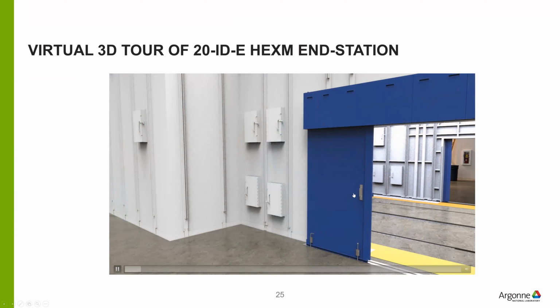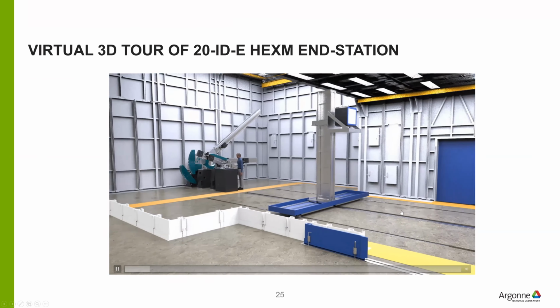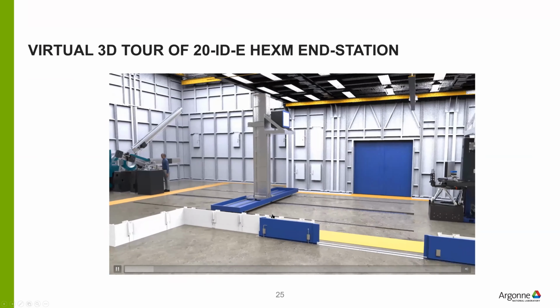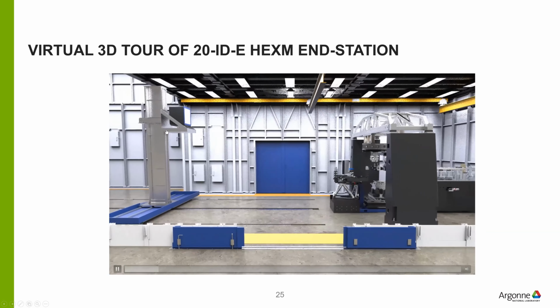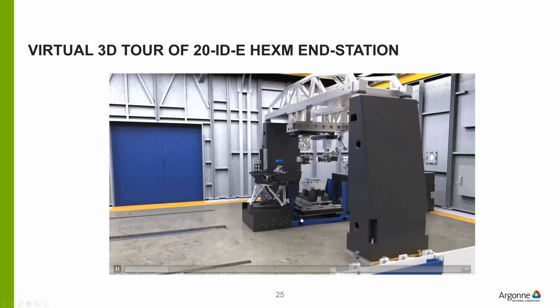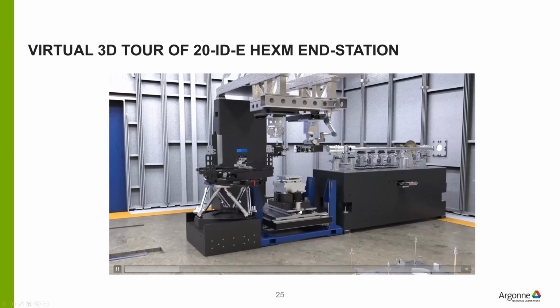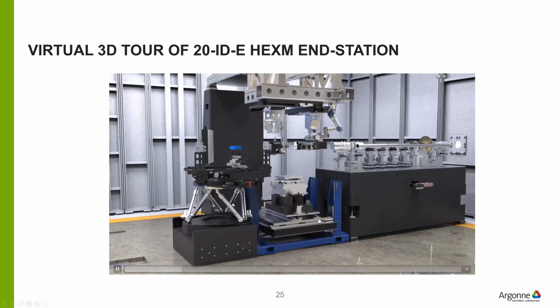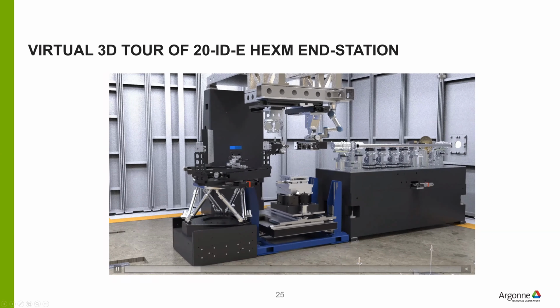So this is what the hutch looks like if you look from outside and do a cutaway. That is what is anticipated. What you're seeing here is the D3 detector, and that is the D2 detector stack that I was talking about. In this case, we have the high load SMS placed in the beam that gives a lot of flexibility in terms of vertical motion and the weight that this thing can carry.